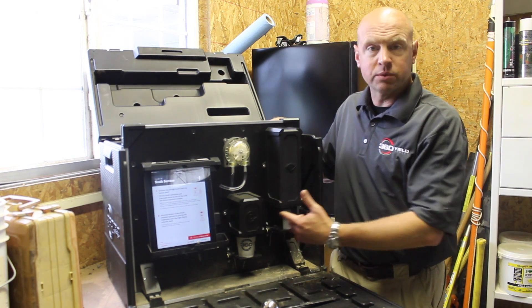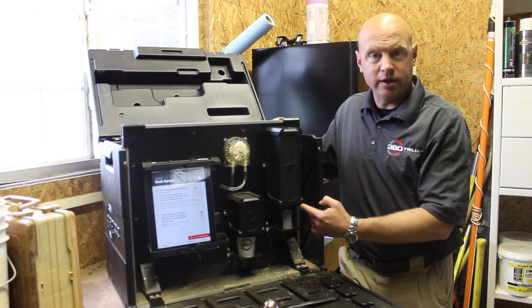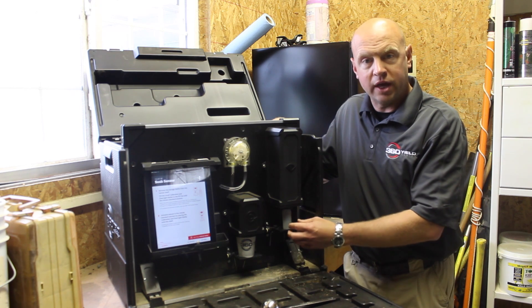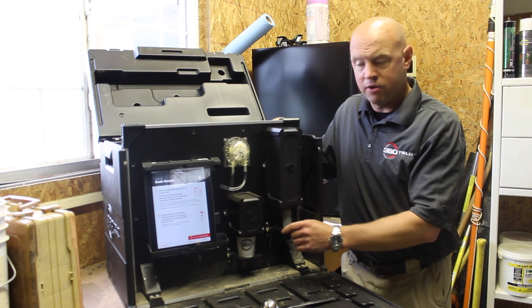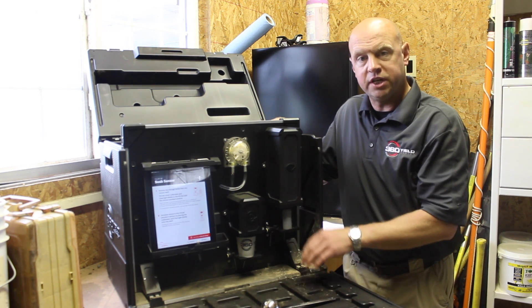The first thing we're going to do when we fire up the machine and get our iPad connected is to calibrate the sensor. That's one of the most important things to ensure accuracy. Soil Scan comes with a 20 part-per-million nitrate solution that we'll put under the sensor, and it'll take a few minutes to get the machine calibrated.